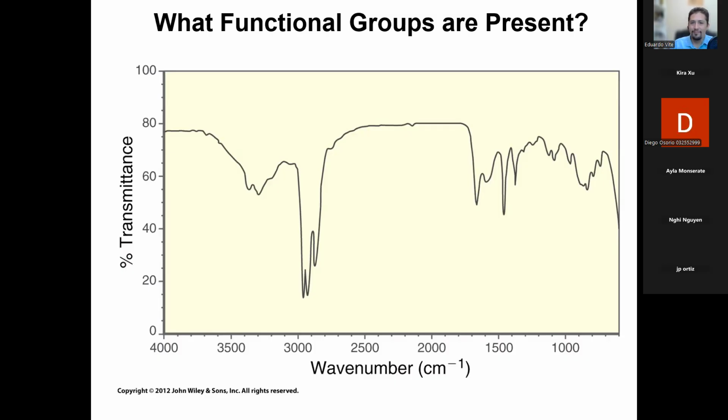Is it an amine? It is an amine. What type? Primary? Primary amine, right? How do you know it's primary? It has the two peaks. And those are what kind of peaks? They're broad and they aren't as intense, right? Yep, not very intense. So we can call that medium, right? And then they're relatively broad, right? They span a while. You see that right there? But more importantly, you see the two peaks right here. And you said that those tell you that it is a primary amine.